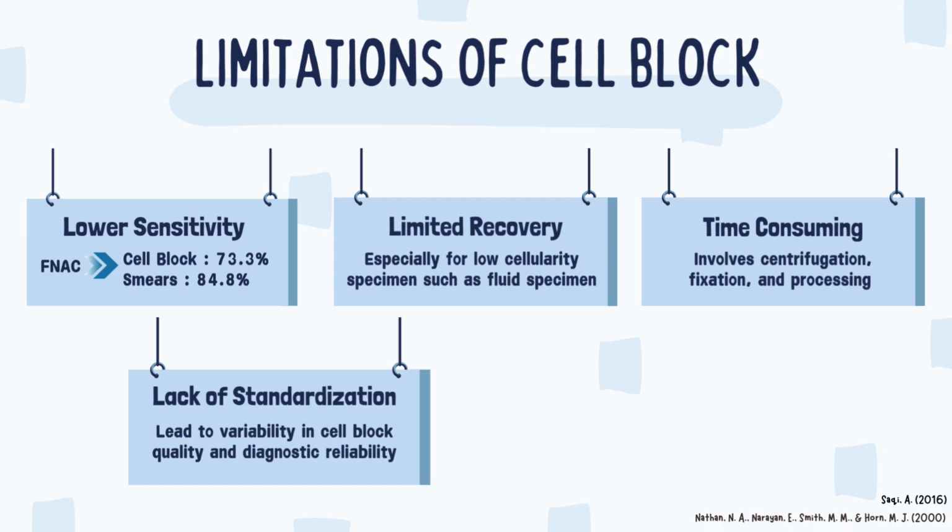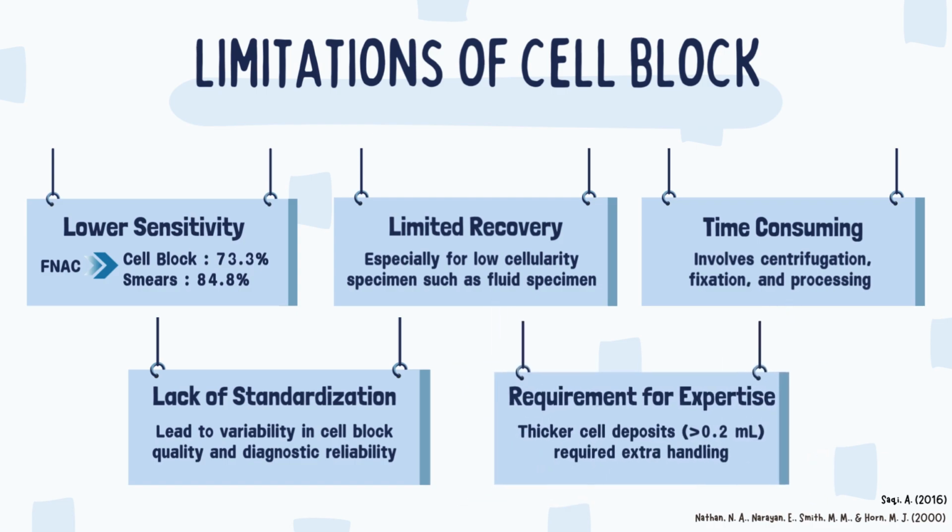Next, lack of standardization. Lack of standardized protocols across laboratories can lead to variability in cell block quality and diagnostic reliability. Finally, requirement for expertise. This is because thicker cell deposits require extra handling to ensure proper fixation.